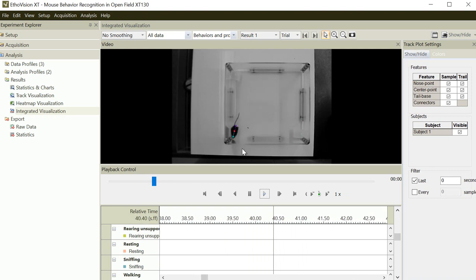Oh, this is really impressive. Of course, this is samples, so this should be good, nice.